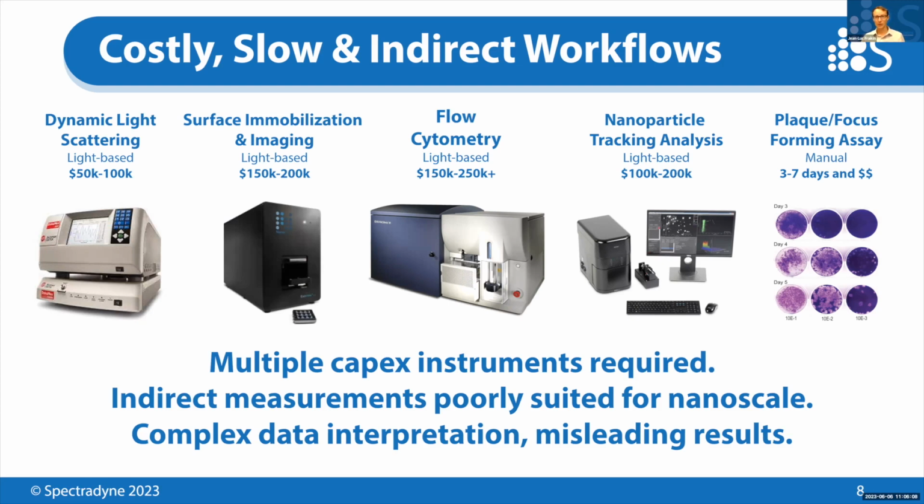There's flow cytometry, of course, which is a very complex technology. There's nanoparticle tracking analysis. And for virus quantification, a big workhorse still is plaque assays, which are tissue culture based. They can take days to do. So many different instruments are required in order to quantify nanoparticles.